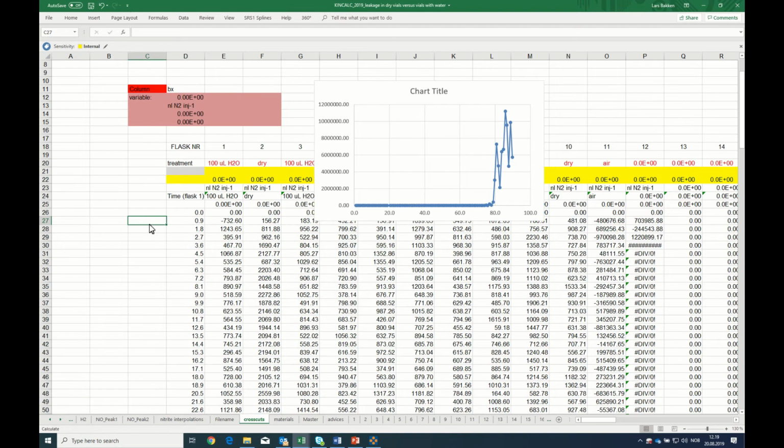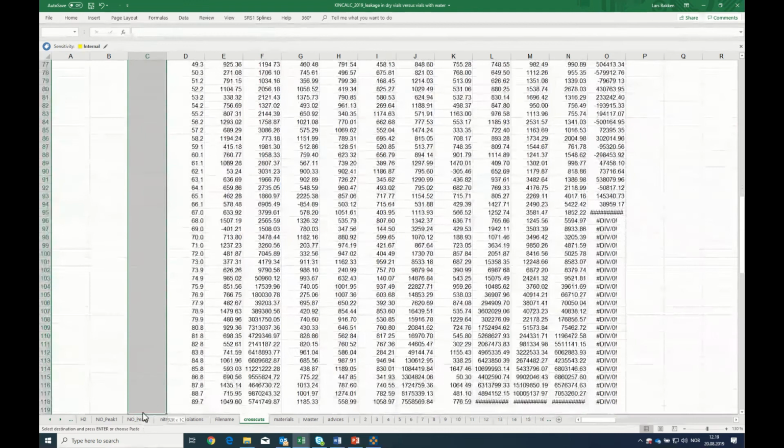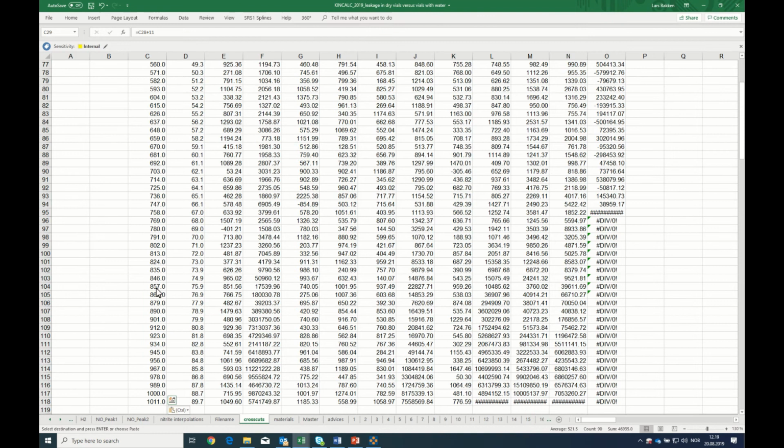Let's say we can calculate that, because here we have 10 piercings, and this one is 10 plus 11, including the one with the sampling. So that would actually be like that. So 1,000 piercings. So that septum has been pierced 1,000 times when we have reached the end of the experiment.